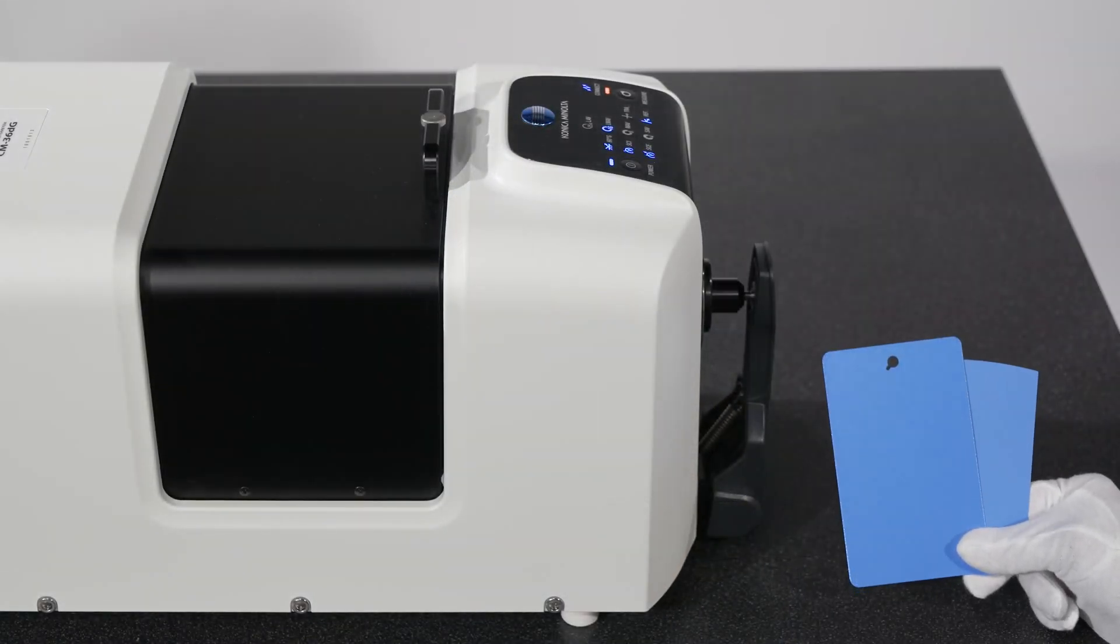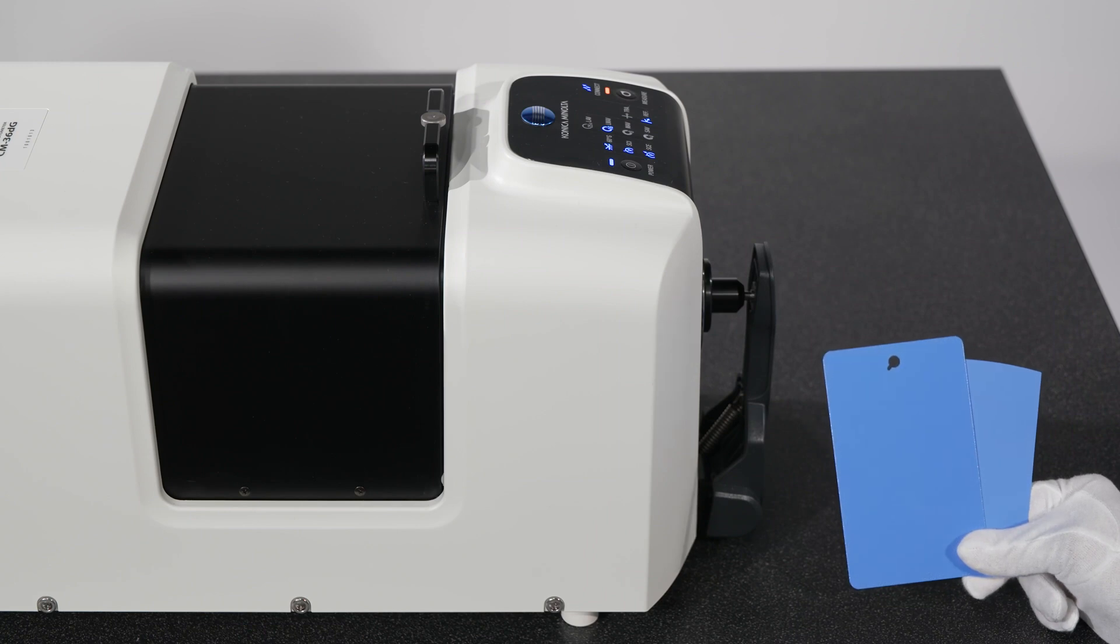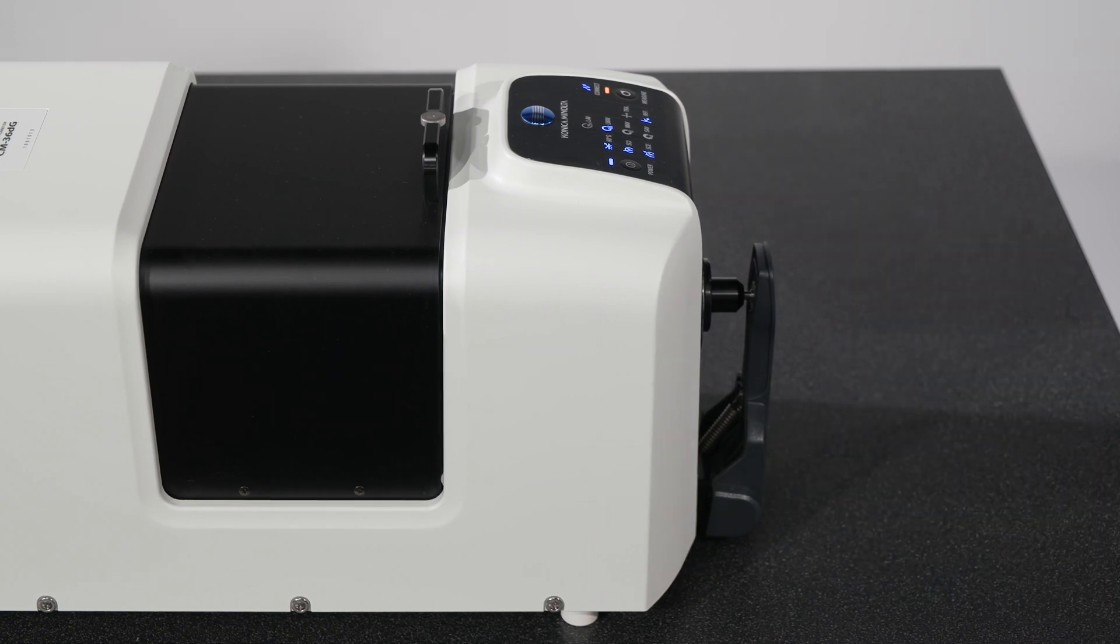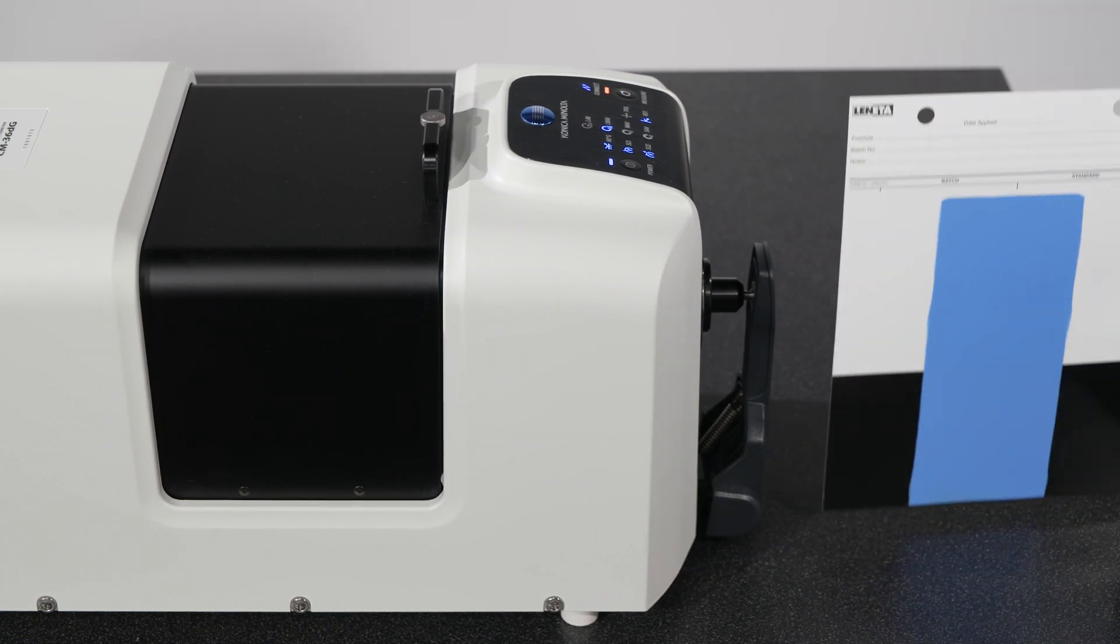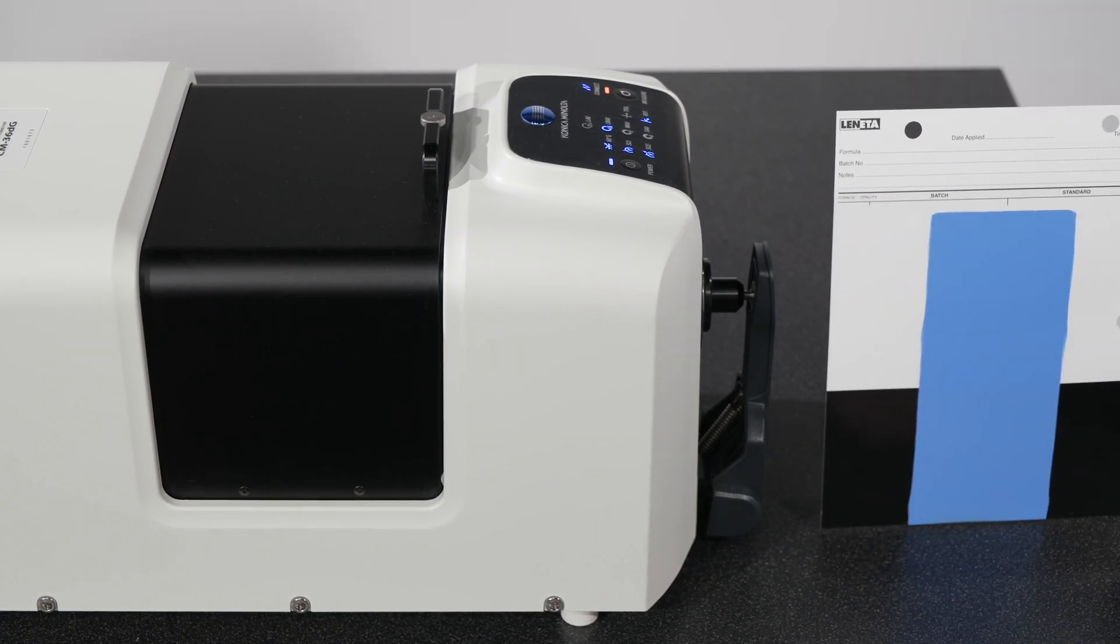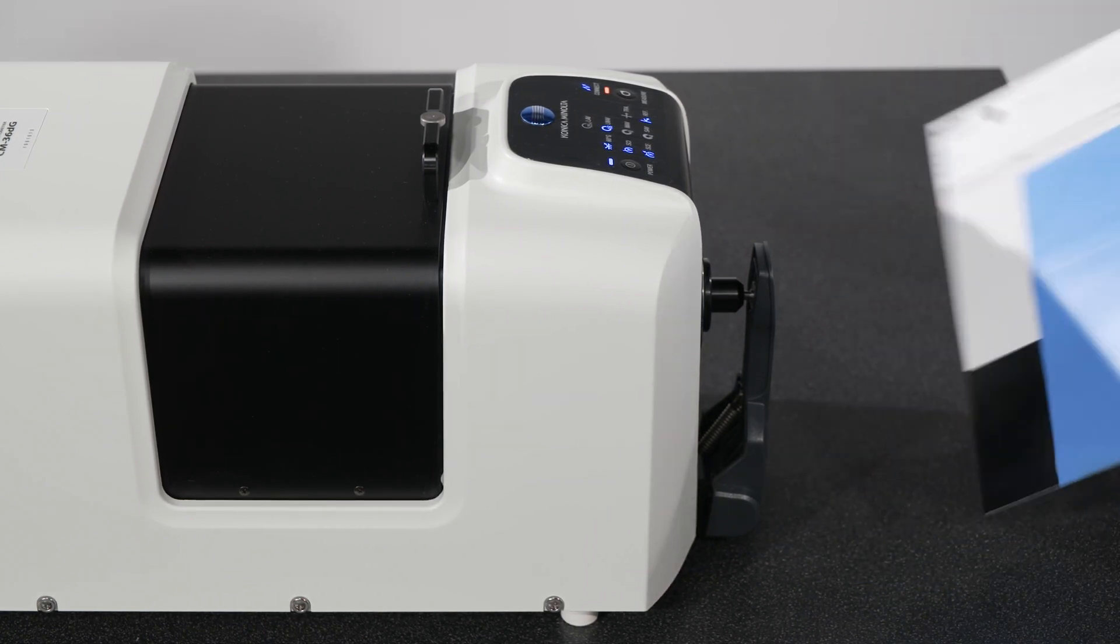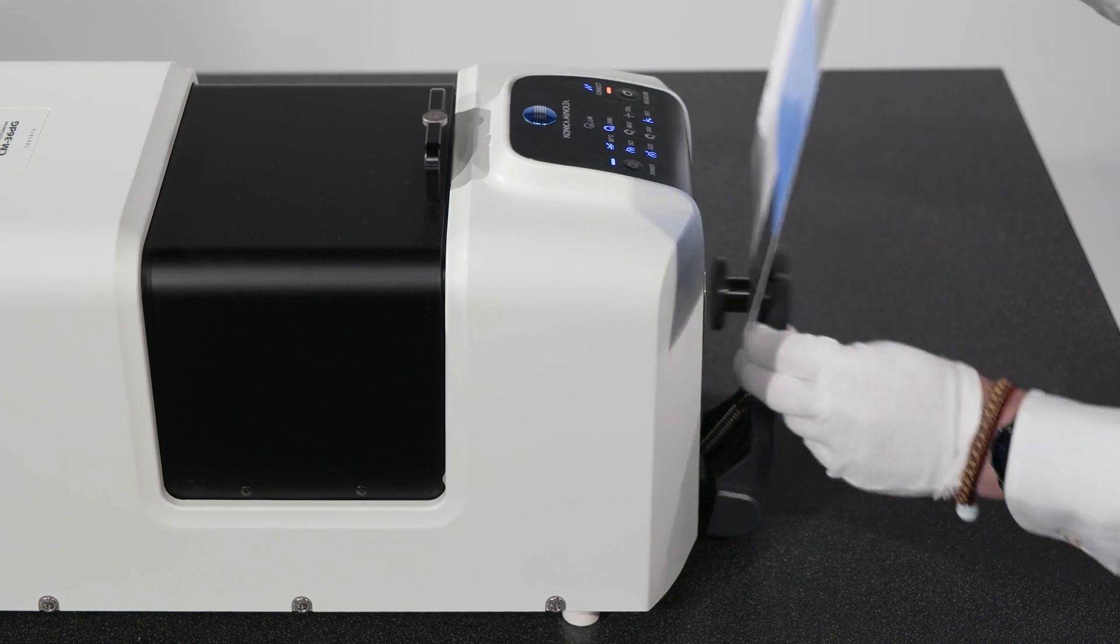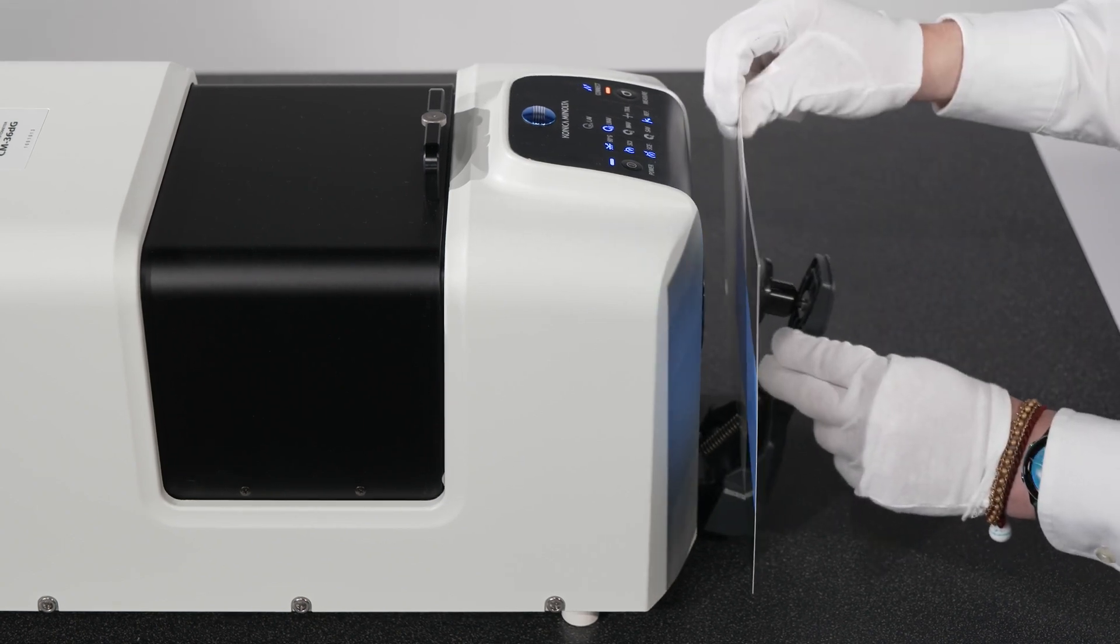The CM36DG provides users with ease of use and the capacity to measure color and gloss in one reading with unbeatable reliability.